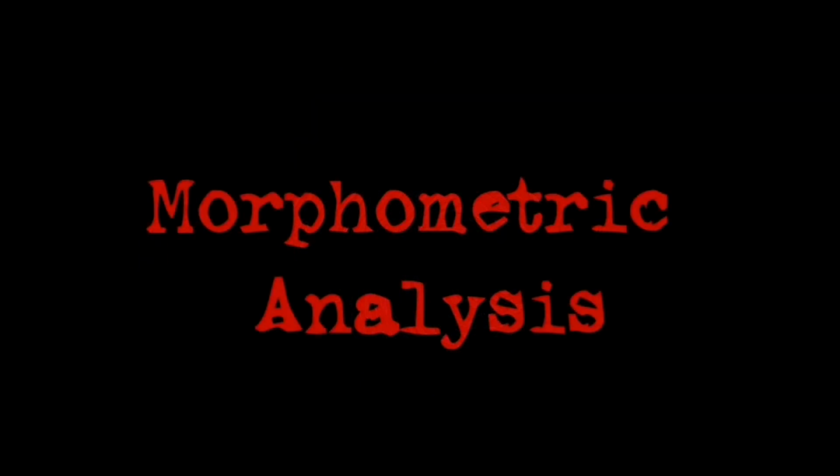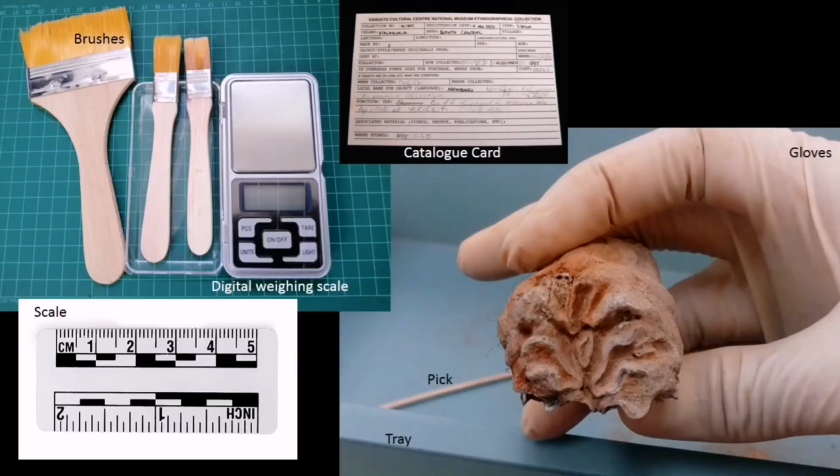So I'm opting for the morphometric analysis. What is morphometric? It is a study of dimension, be it 2-dimension or 3-dimension. It is the measurement of the outer form of, be it organisms or organs.